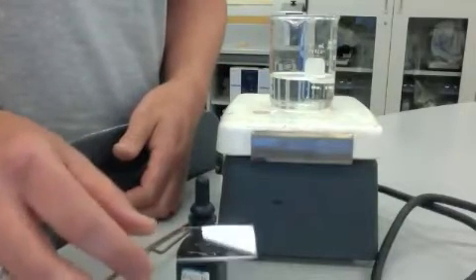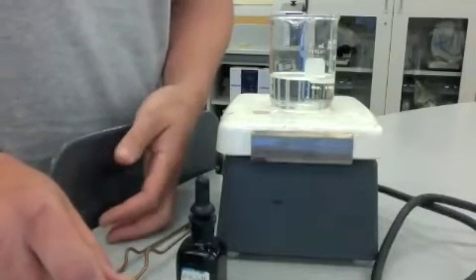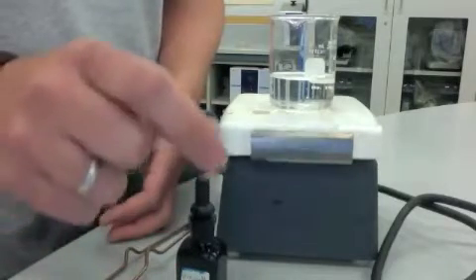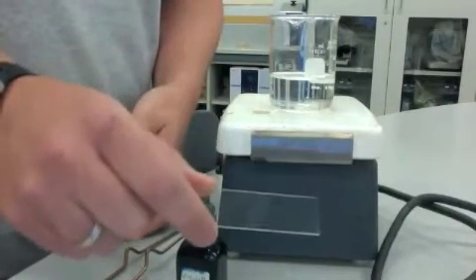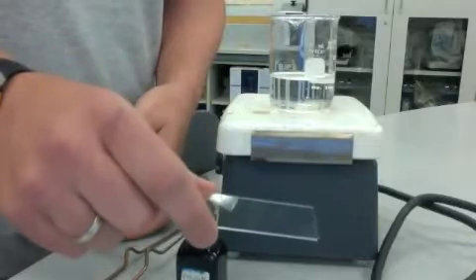The procedure for spore staining starts out exactly the same as for gram staining. You put your sample on in a little puddle of water, spread it out, dry it, and heat fix it.